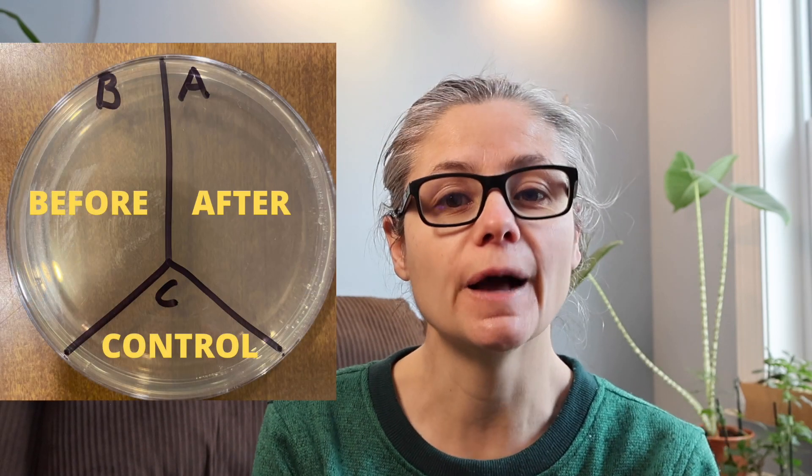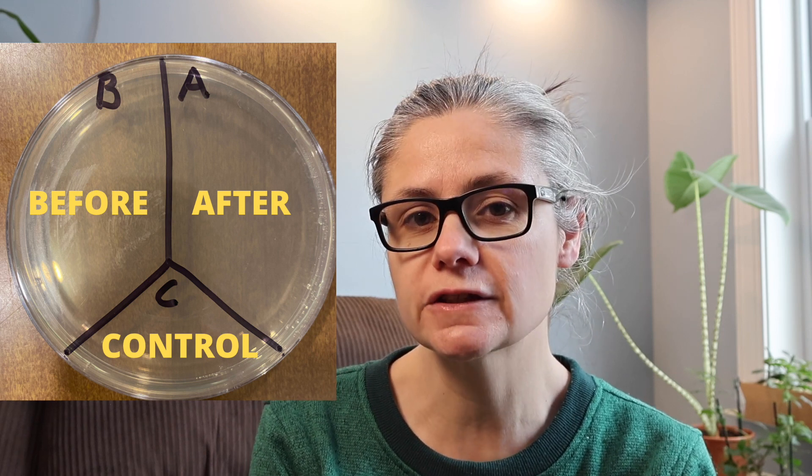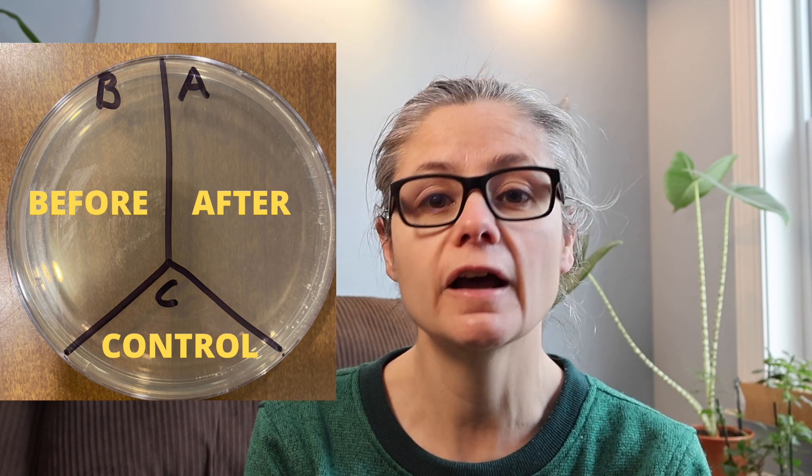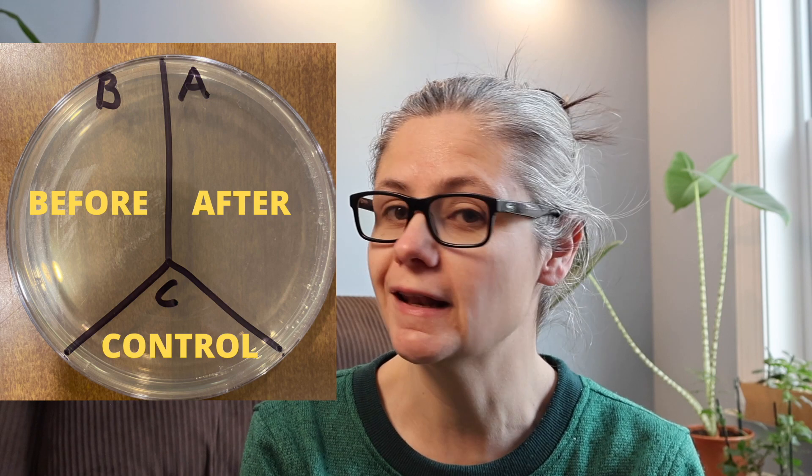But how well does it remove bacteria? In order to test how well Force of Nature removes bacteria from my home, I'm going to take some sterile swabs and a petri dish like this, and label it A, B, and C. I'm going to swab several areas around my home and place those samples in the section labeled B for before. Then I'm going to clean the area according to Force of Nature's directions — spray, let the area remain wet for 10 minutes, then wipe — swab the area afterwards and place that in A for after. C is our control; nothing's going to go there. I did purchase a Force of Nature bundle, and it came with these cleaning cloths, which I'm going to use to wipe my surfaces after the 10 minutes.